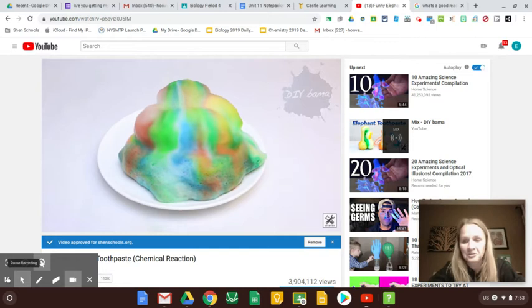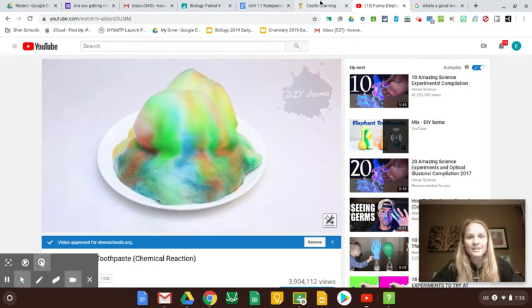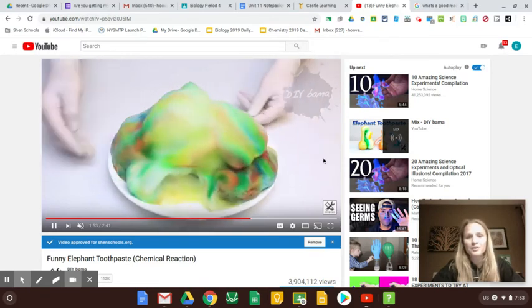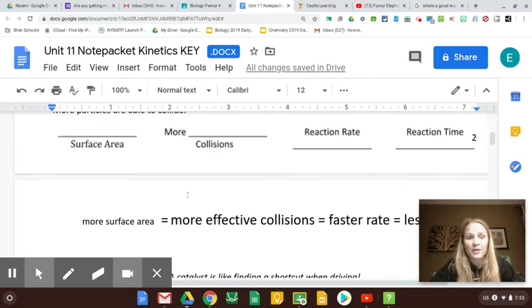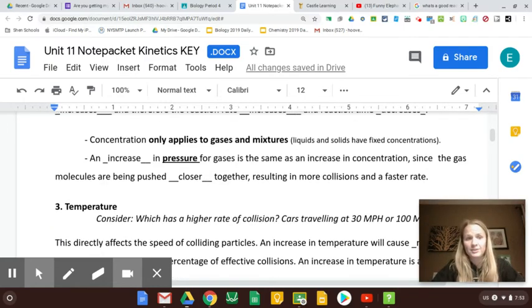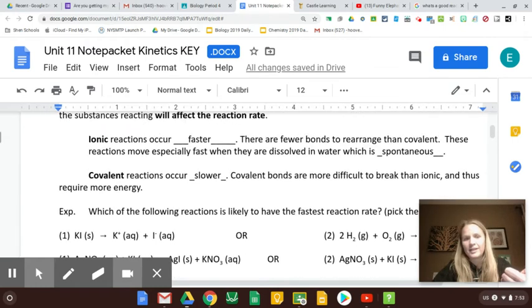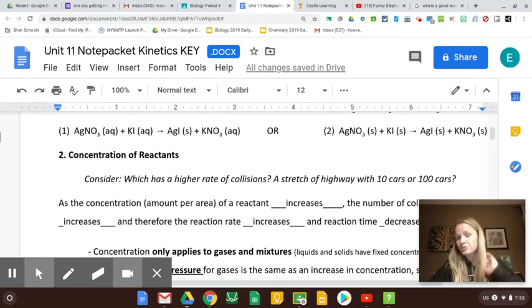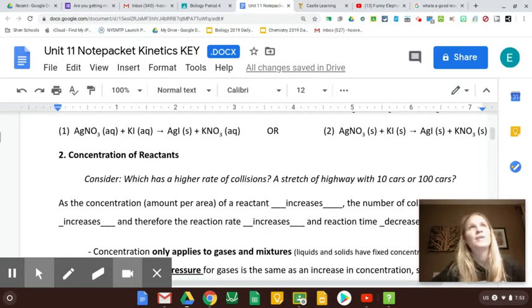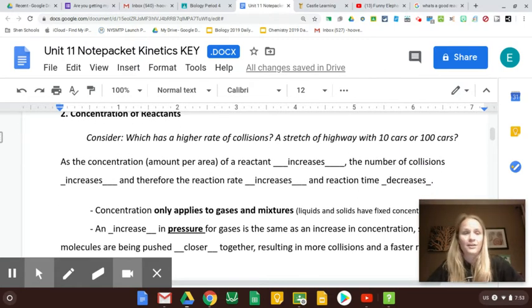Oh, they do it in a sponge — I've never seen that one before. So again, what could we do to make this even more interesting? How do you speed up a chemical reaction? We can make it more concentrated. The first way to increase rate is the type of reactant, but we don't care about that. We're going to use super strong hydrogen peroxide, which I've gotten on my fingers before and it does eat the skin away — it hurts.